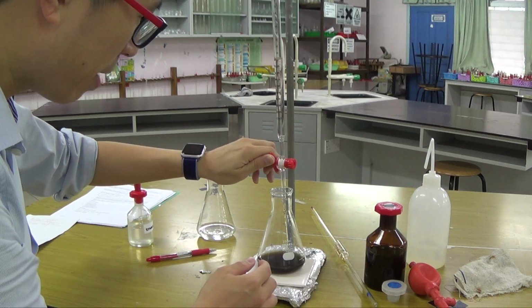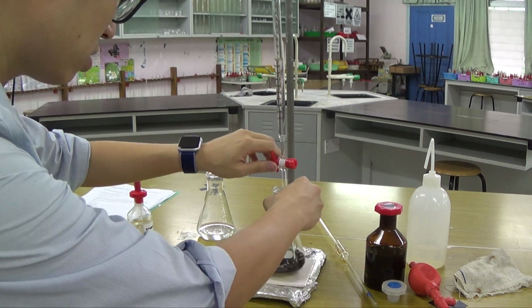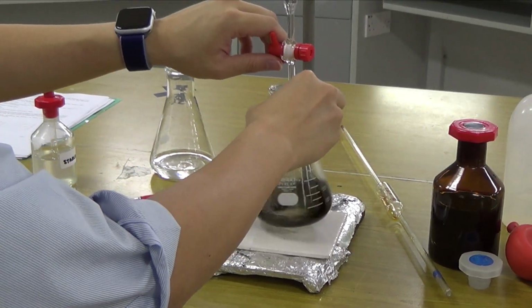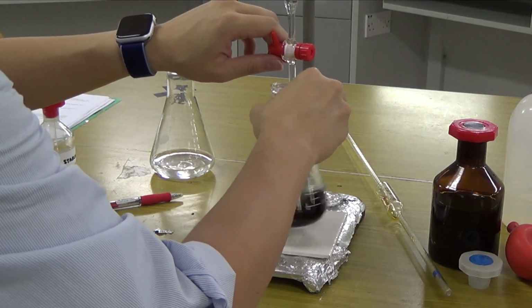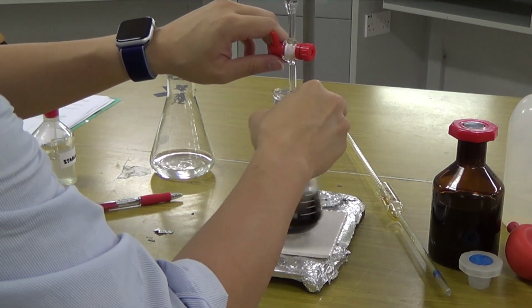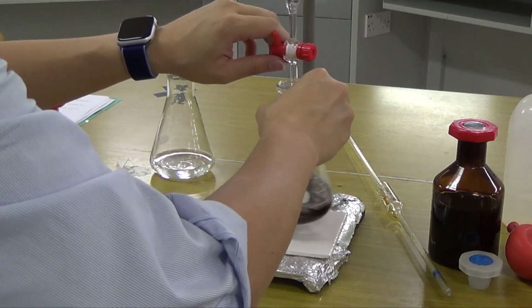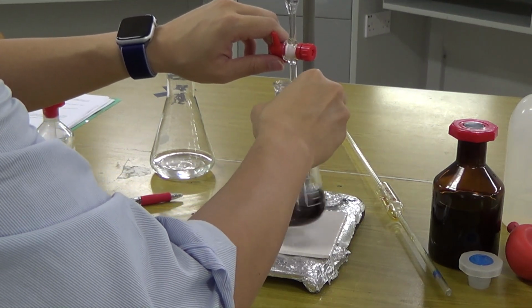Oops, my bad. Too fast. Okay, that is just right. So I hope you can see the color change there. So that is drop by drop. My eye doesn't leave the thing above the white tile. As soon as it changes color, then I stop. I do not care about the volume. I don't read the volume right now. I read the volume at the endpoint. My left hand doesn't leave the tap. As soon as it goes one drop and then colorless, I will stop. That will be my endpoint.